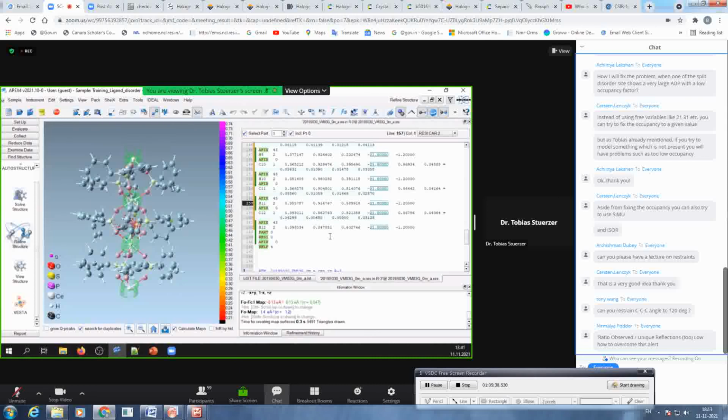If the unit cell is right, and it's really a case of ultra weak data, which I do not believe, then there may be some tricks to tweak the integration parameters. I don't know whether you explained that in the best practice workshop tomorrow. Did you mention integration parameters? Yes. Okay, so maybe you should join the best practice workshop tomorrow, which is the same workshop Karsten and Pratap did today, and they will explain a little bit the advanced integration parameters.